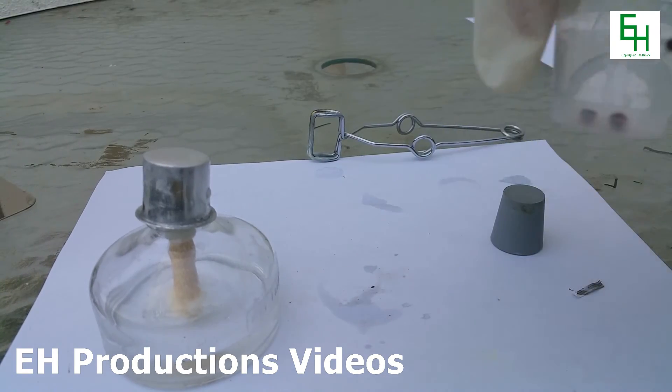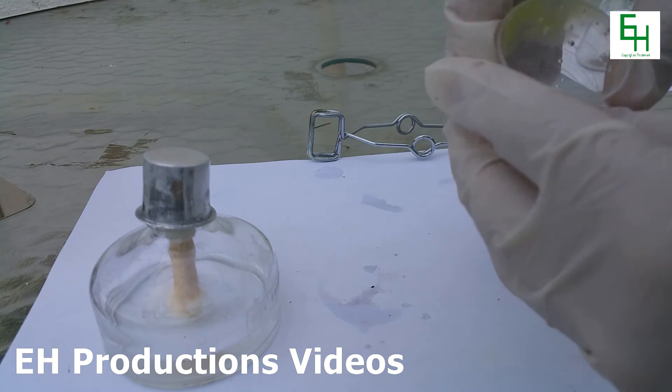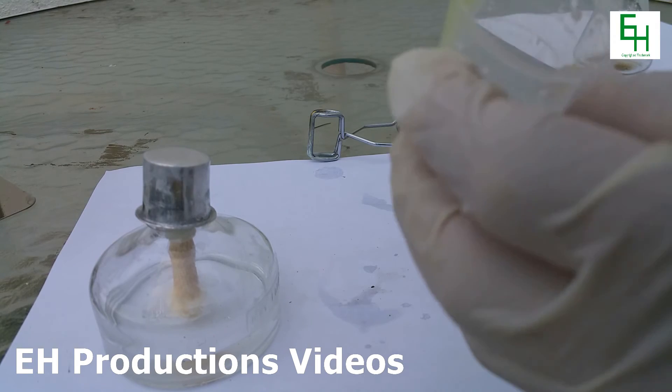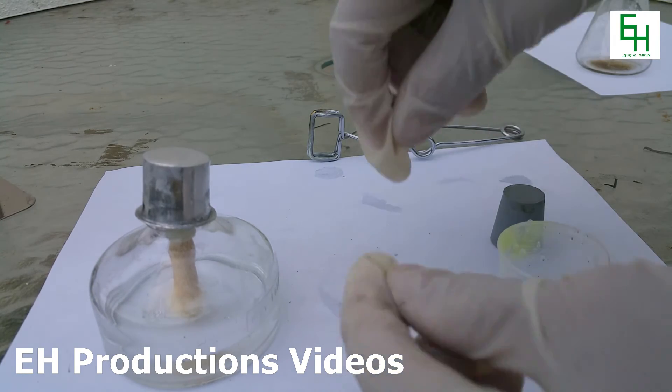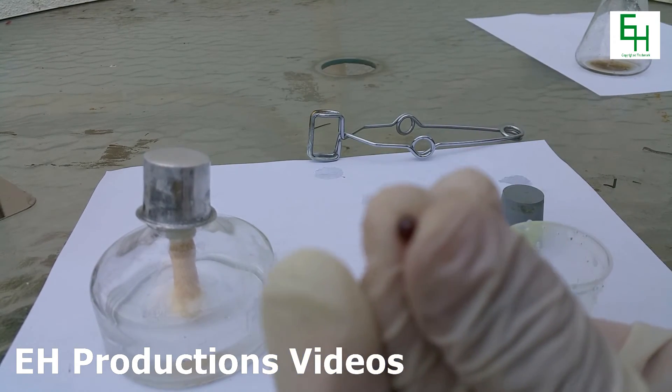I'm going to cap up the alcohol burner and I'm going to dump the water out. Alright here it is. Since it was so viscous we can only make small beads of it also because I didn't use a lot of sulfur.